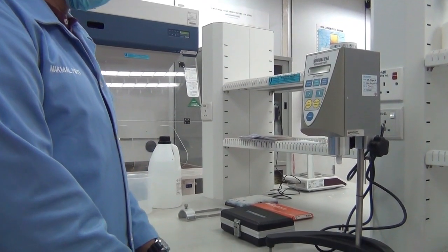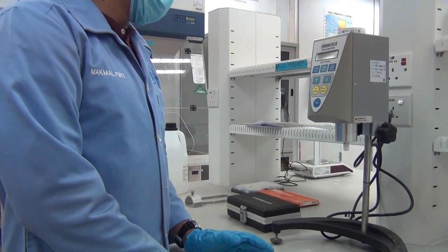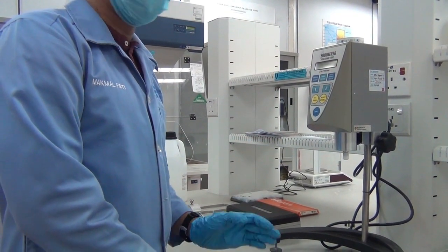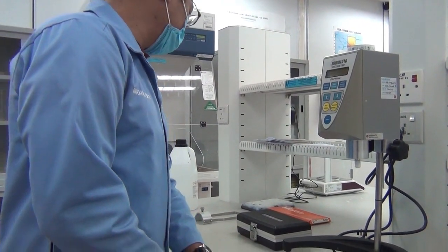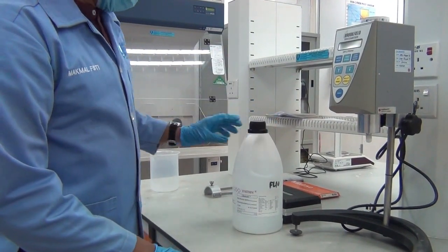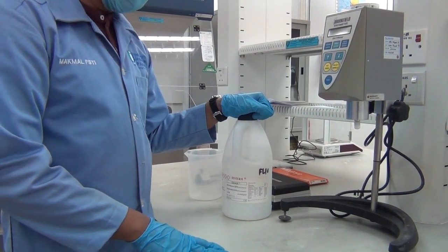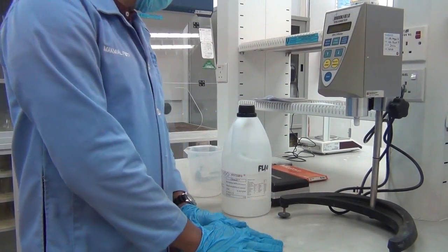For this lab, Rheology and Colloid lab, in experiments 4 and 5, we will use this instrument to measure non-Newtonian and also Newtonian fluid. Today we will conduct the experiment using ethanol, which is ethyl alcohol, a Newtonian fluid or Newtonian liquid, and the non-Newtonian fluids are measured the same way using this instrument.